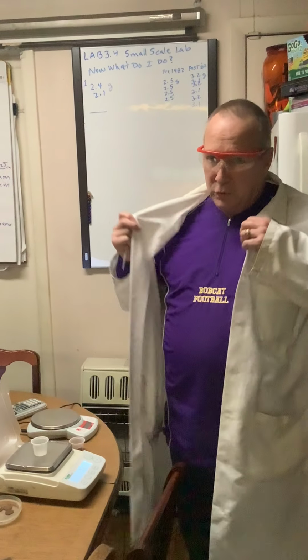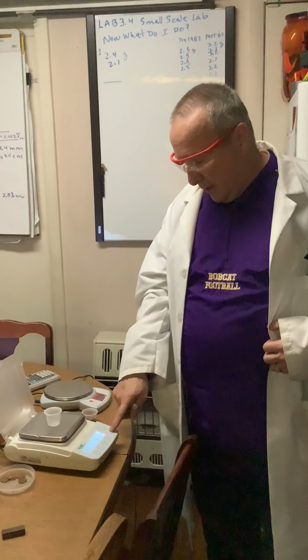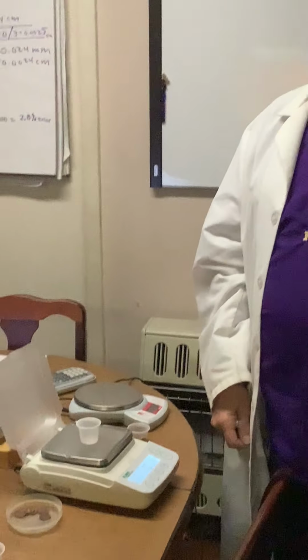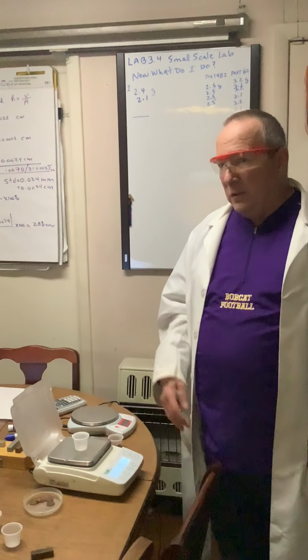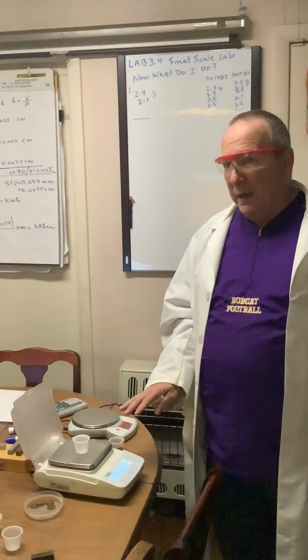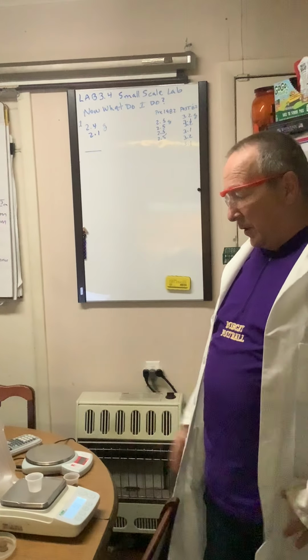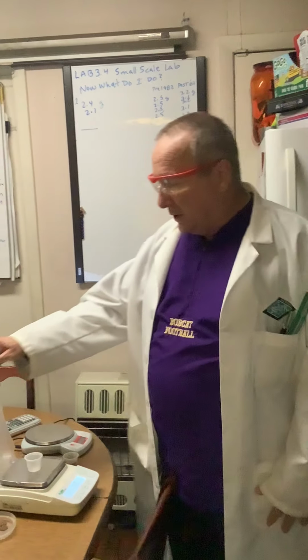And now I need to put 50 drops in it and then weigh it again. One thing I can do is subtract the difference. It's called weighing by difference. But another thing I can do is just hit this button that says tare, T-A-R-E. When we tare something, we subtract the initial weight, typically the weight of the container. So I just tared my balance. These are really nice balances. That's a nice feature. I don't have to write beginning mass, ending mass. I just tare it, and it subtracts it automatically, and I reset the machine to 0.